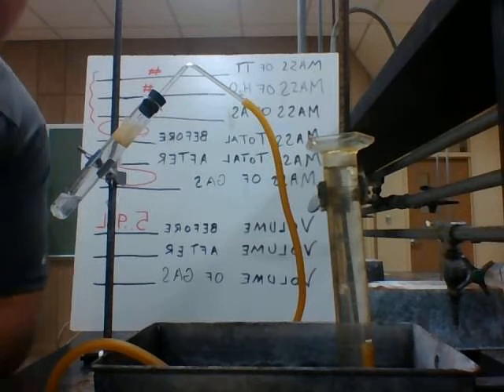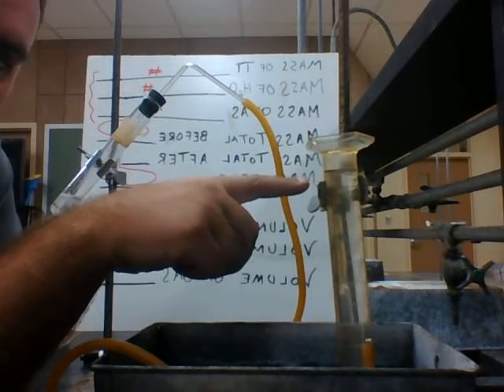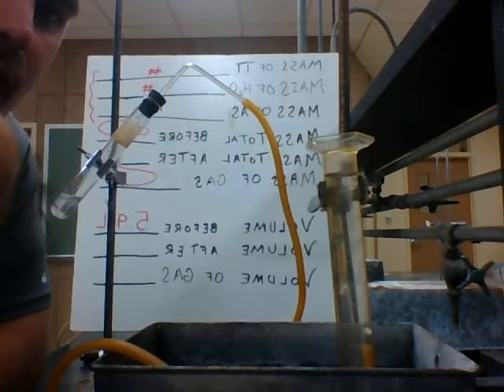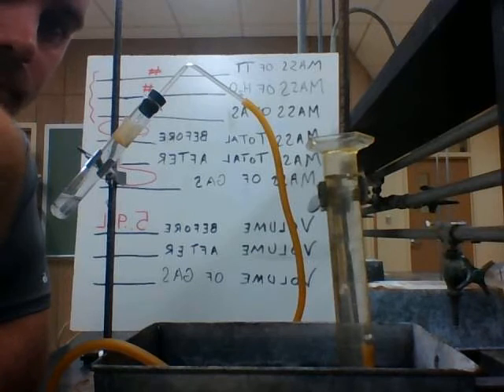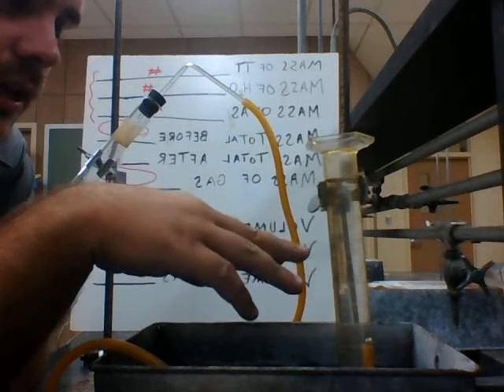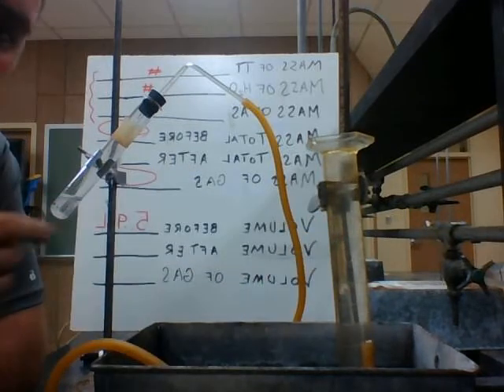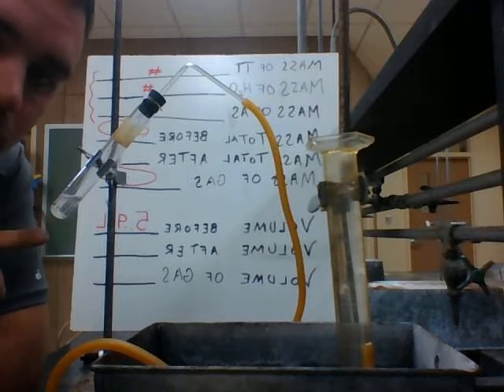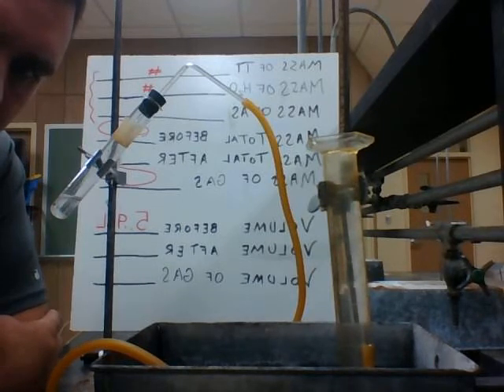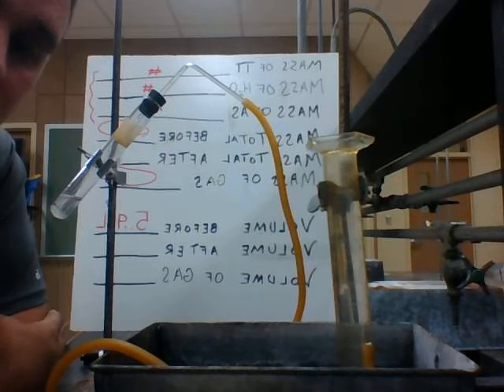Now, once it gets done bubbling, you should see the water level dropping because it's called water displacement. So we're displacing the water, collecting our gas, and I should be able to read it. When it continues to bubble, we'll make sure we read what the level is. If you watch here, you can still see bubbles generating. Once you see that the rate of the bubbles has decreased a lot or it's not going very fast, I'd give it another minute or so just to make sure that it's done.